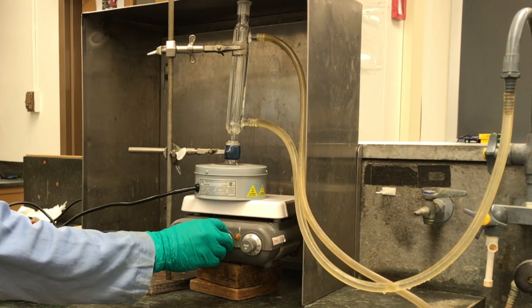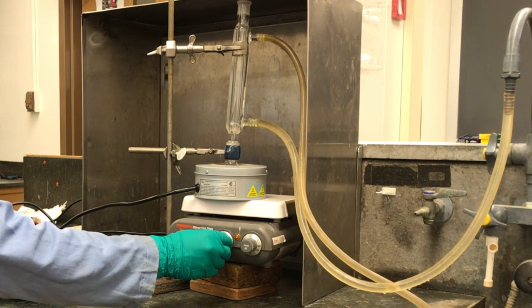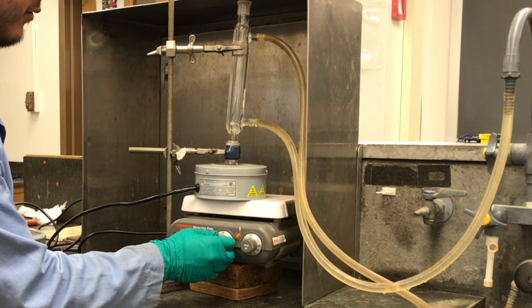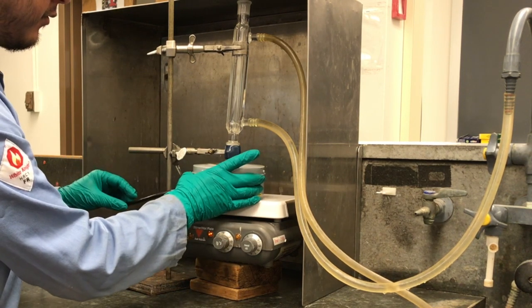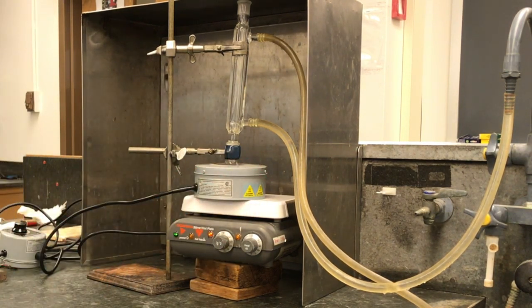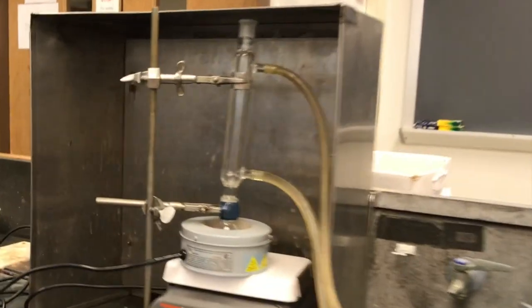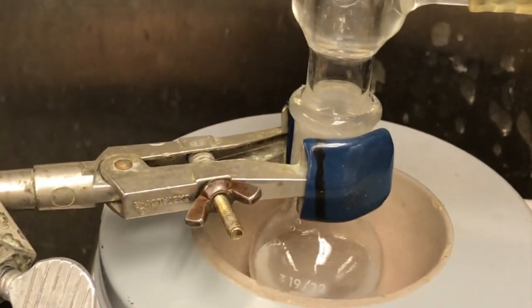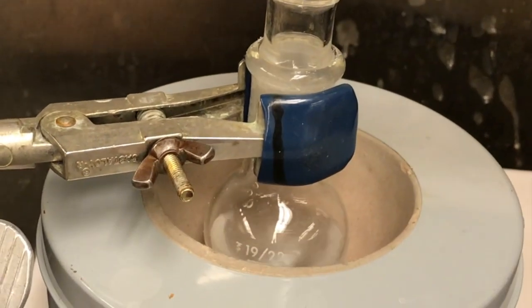So now that we added all of our reagents to our flask, we attached a reflux condenser, and then we also have a thermal well heater set up so that we can heat the reaction. But before we do that, just want to give you guys a close look at the reaction. You'll see that it's colorless and it looks clear.